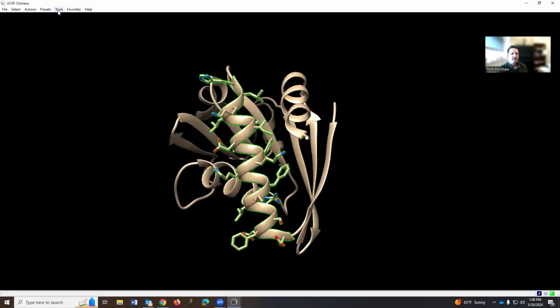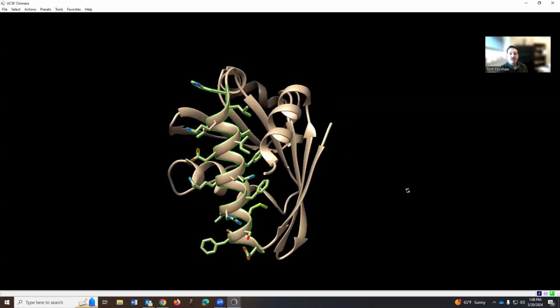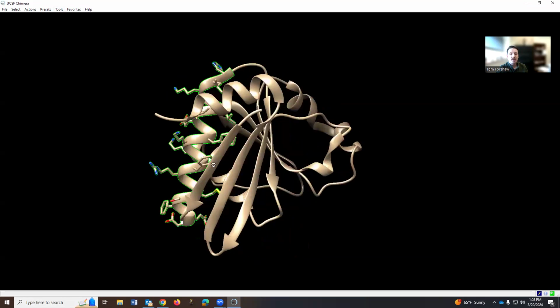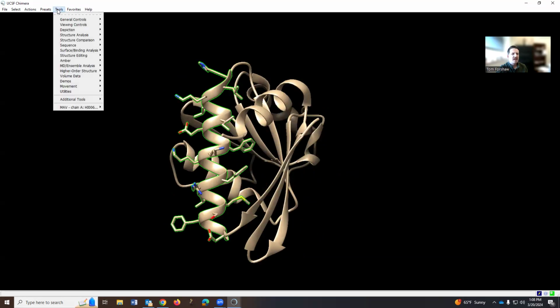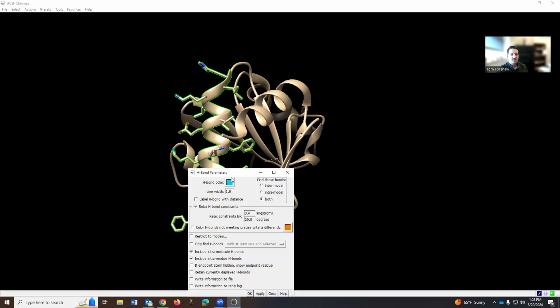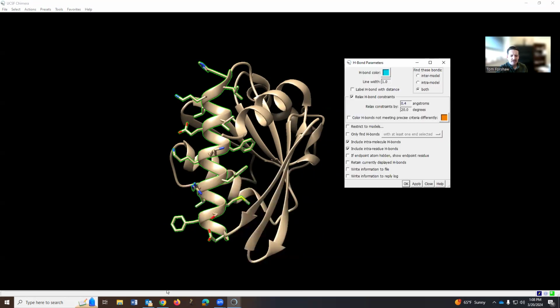If we click, we're going to do the analysis. We're going to look for the hydrogen bonds and say, hey, can you show us where there are hydrogen bonds? We click Tool, and then it is Structure Analysis, Find Hydrogen Bonds. And you need to tick some of these.